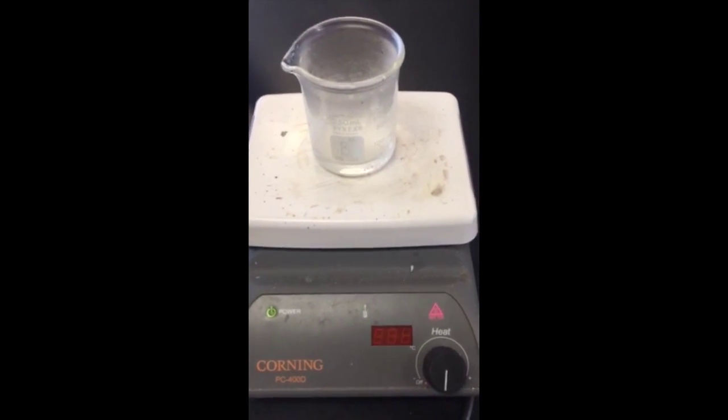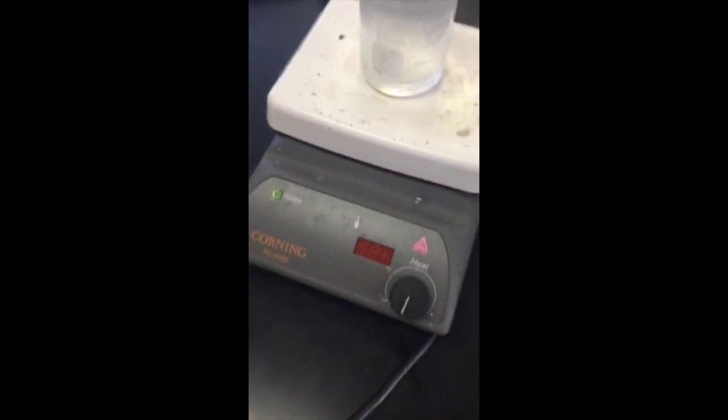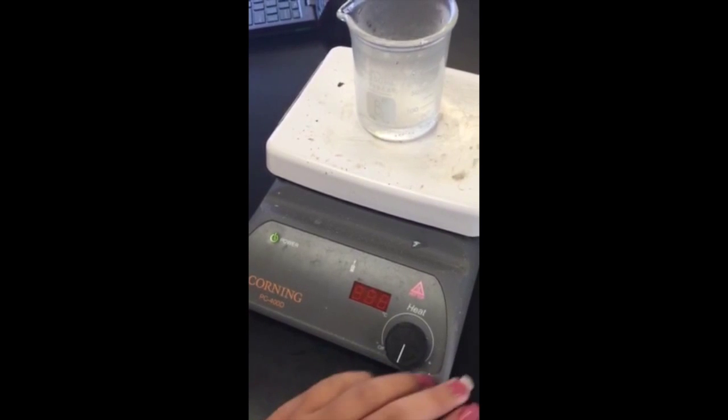Three to five minutes later the water is boiling. The heat is still on 550, we're going to turn off the heat.